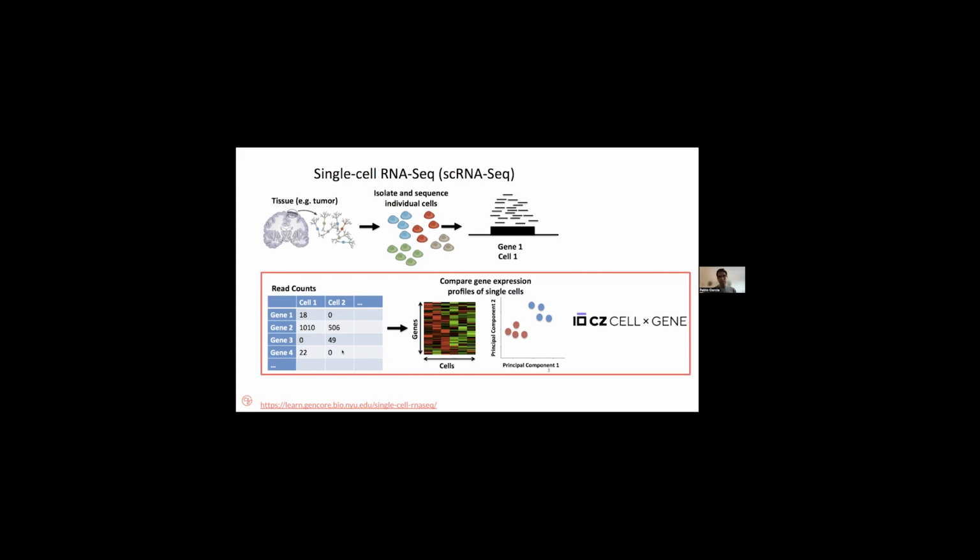Well, CELLxGENE helps you specifically with the processed data. So you probably learned a lot about what happens early on here, and maybe some of the coding exercises that you guys did also happen around this analysis area, where CELLxGENE is where it excels in grabbing these matrices and making sense out of them with specific tools that we have created for that.